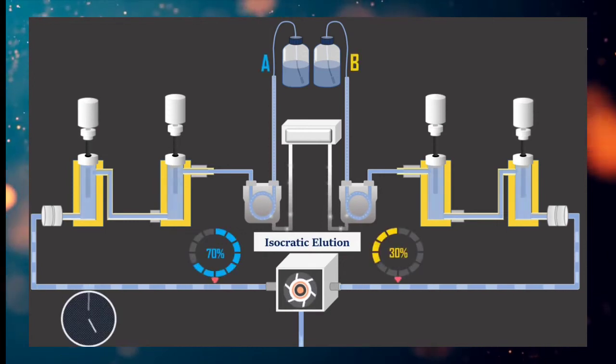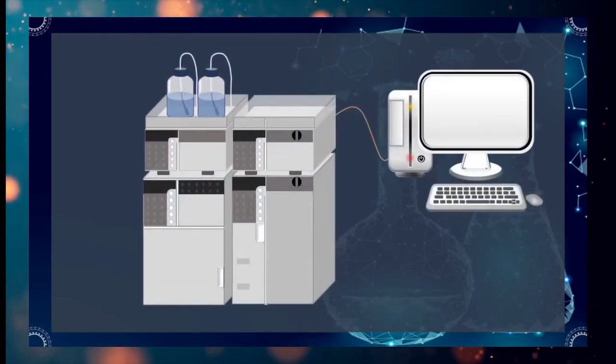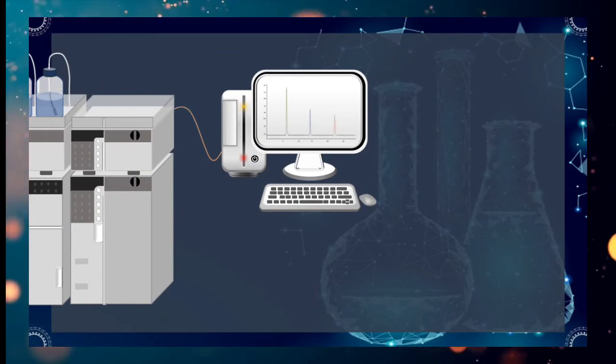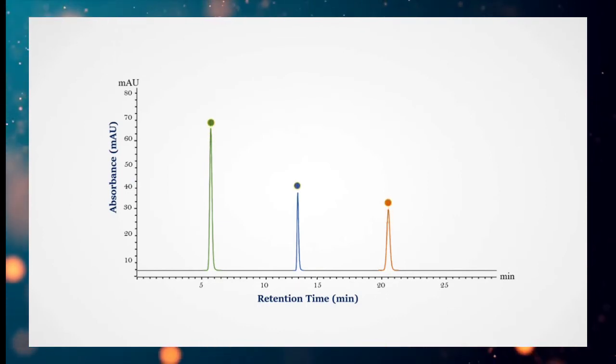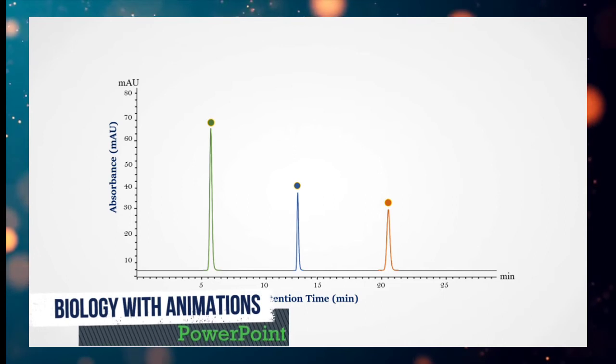From there, a big discussion should be taken by higher officers on whether the food product is safe for consumers before marketing, based on the interpretation of data on the graph of the HPLC chromatography released by the computer. So now, are you guys clear? This is how safe food is produced and checked repeatedly to make sure consumers eat healthy and safe food in their daily life.